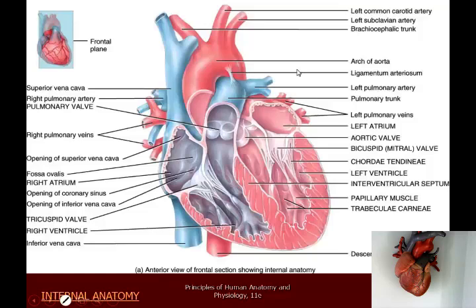So you use the thickness of the ventricular wall to go, oh, I see, that's the left side, that's the right side after you open it up. Once you figure out which is left and right, left is going to have the thicker wall, then you start working your way from there. I got the ventricles, that means those are the left and the right atrioventricular valves. I work my way superior, that's the left and the right atrium, etc.